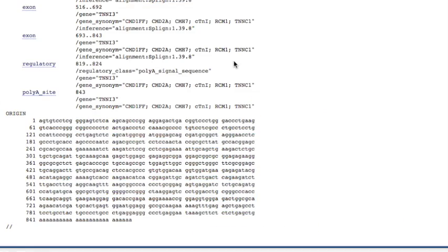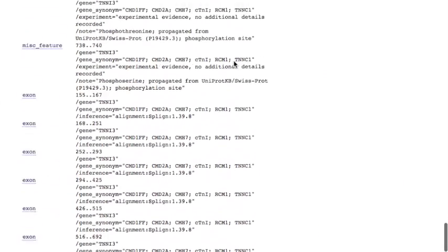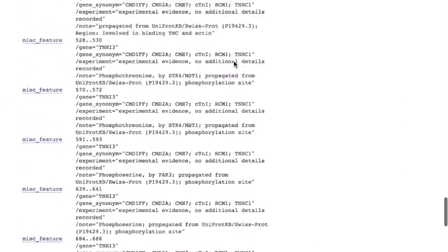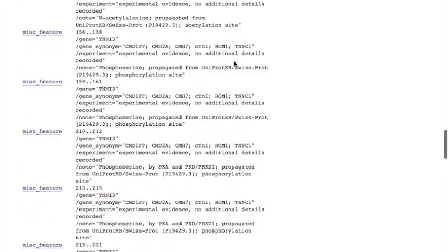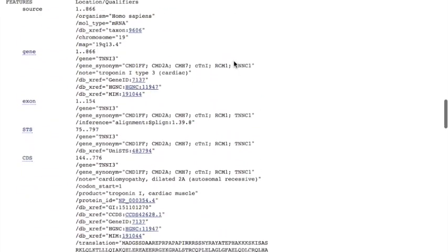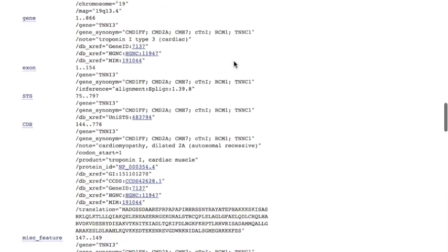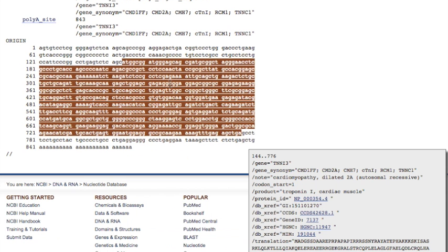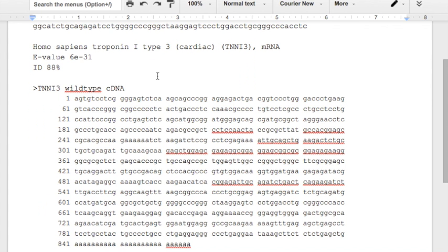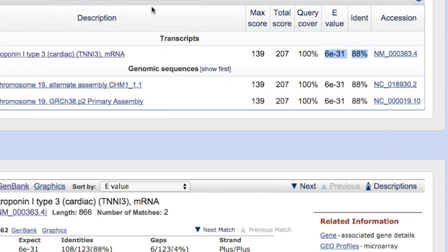Okay, next, we'll probably want the protein sequence as well. And so if we go back to that GenBank page, we scroll up. There are a couple things that will be very useful for you. First, on the left are headings that give you information about that gene. If we click on CDS, which is coding sequence, this tells us that the actual coding sequence within that cDNA sequence, showing the start codon, the ATG, and the TGA stop codon here. That's probably something we'll want to note.